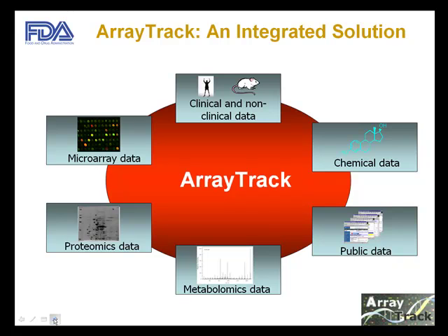This picture shows how integrated ArrayTrack is. It is not only capable of handling microarray data, but it can also be used to do meta-analysis with proteomics and metabolomics data. It can definitely store any type of study information for clinical and non-clinical studies. And we also have public data which has been pulled from public repositories and stored in ArrayTrack. This is very useful for biological interpretation.